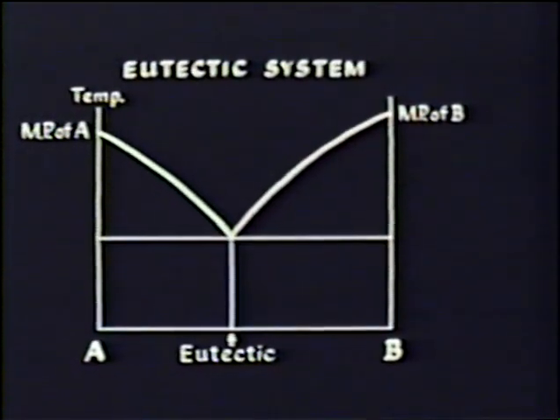This composition diagram shows the melting points of the various mixtures of two components, showing eutectic formation. Using azobenzene and bromocamphor, we will show how these two components crystallize in a mixed fusion. Here we see azobenzene growing from the upper right. The growth rate decreases sharply as the crystal front approaches the zone of mixing.